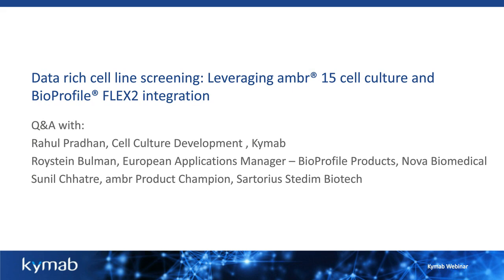I have another question regarding the sampling for you, Rahul. If you sampled every day, did you have a problem with the volume in the vessels? No. So this didn't affect the culture? No, it did not. So we run our systems at a scale down, for larger vessels, so it did not impact our volume. Thank you very much.